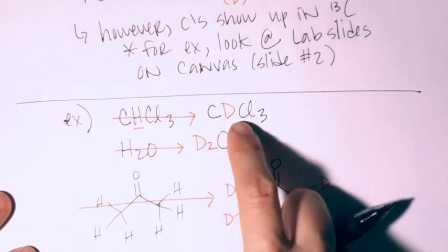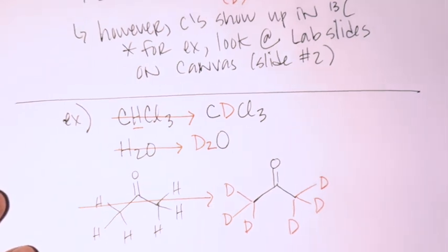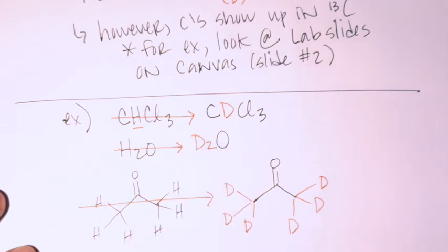and it's showing you where those peaks show up. So like in a problem or something, I would have these labeled, and you would be told that they are the solvent peaks. But if you see weird little peaks that are usually much smaller than your actual compound peaks, those usually result from one of these solvents that have carbons in them. D2O, of course, doesn't have any carbons, so this one wouldn't show up in the carbon NMR.